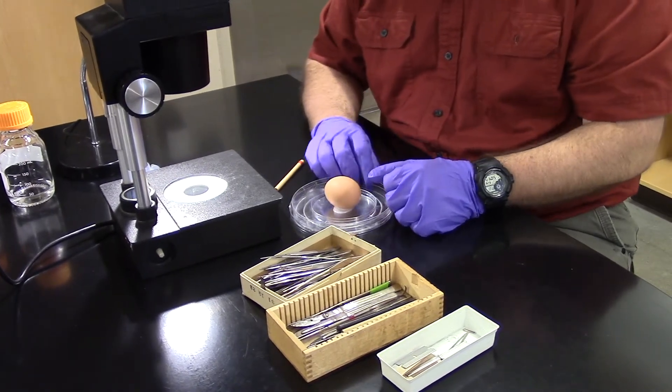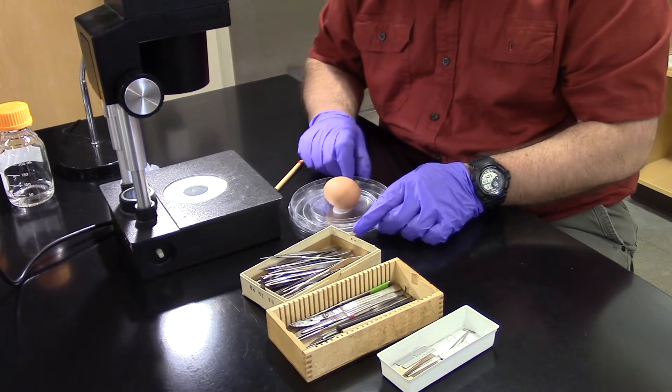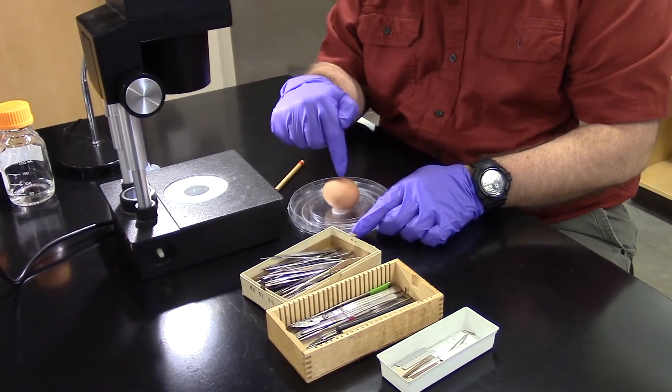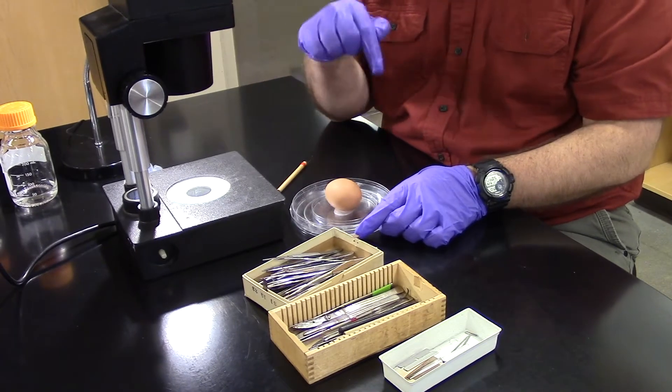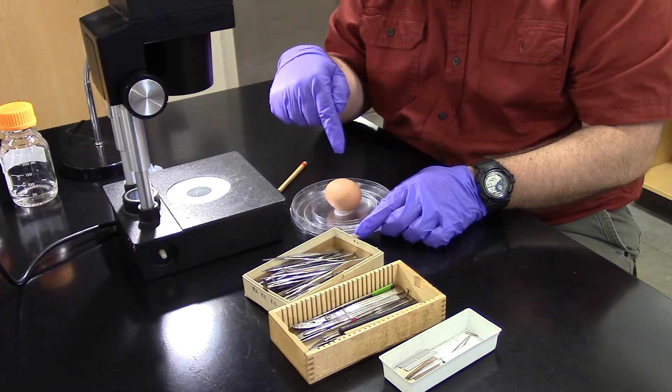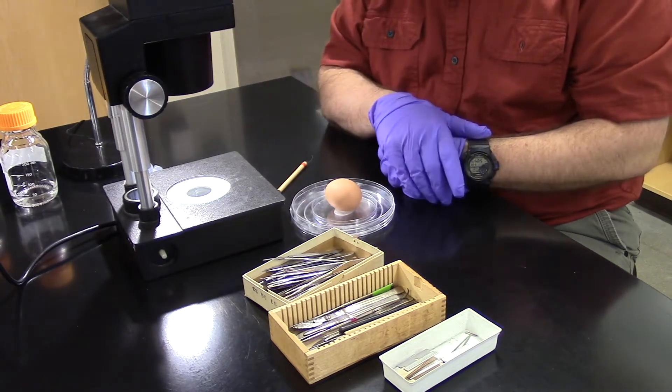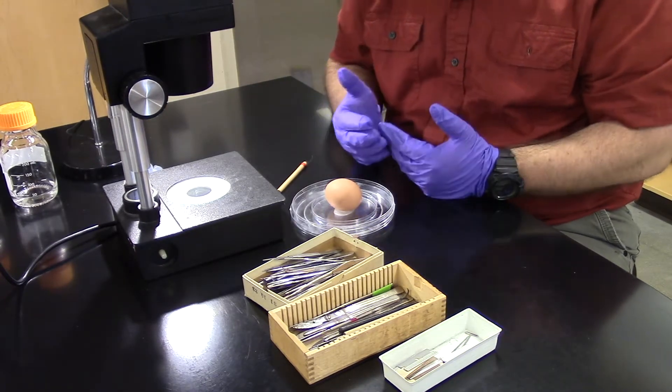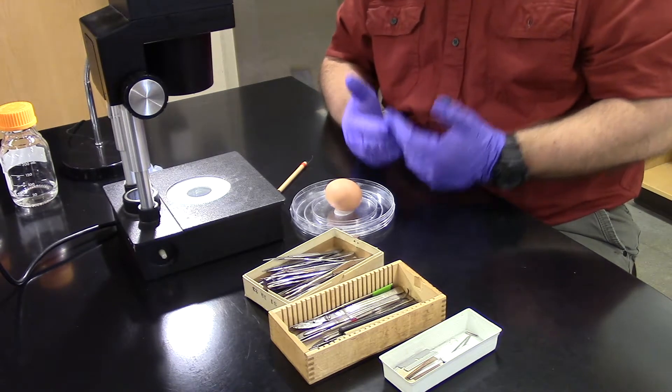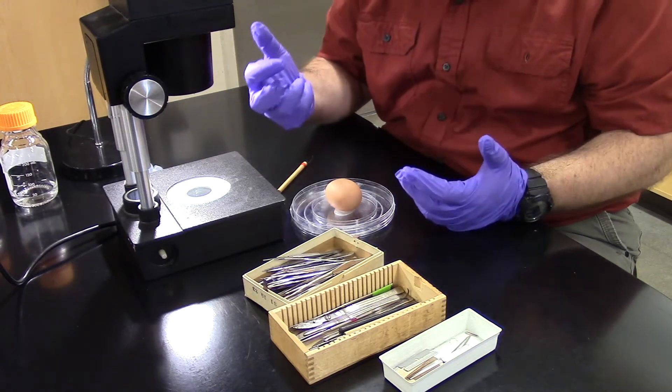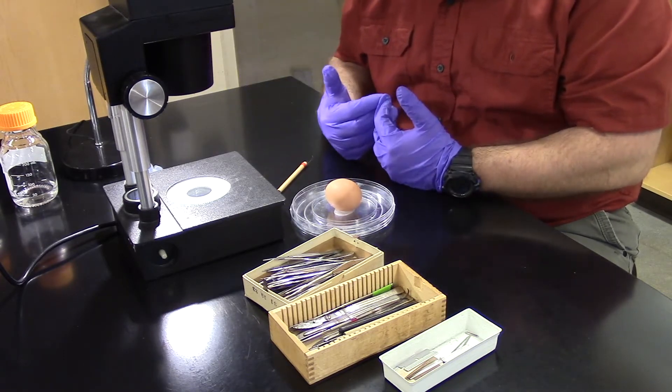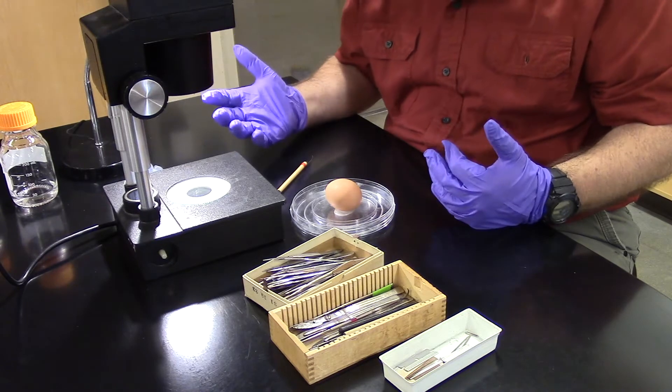Now what we're going to do is make a window. This is called windowing the egg. This allows us to see through this hard, opaque shell and look into the embryo. We're going to remove the calcified shell so that we can see what's inside the egg. This allows us to keep the embryo alive while we do the experiment. In case we as developmental biologists wanted to study the egg, we could then put it back in the incubator and watch it for the next 21 days to see what happened.